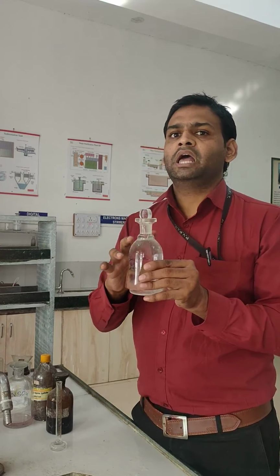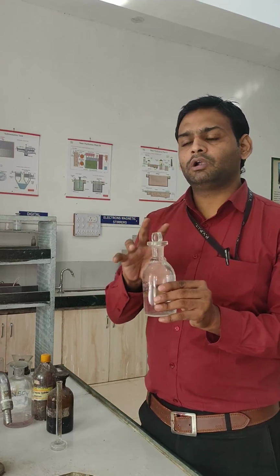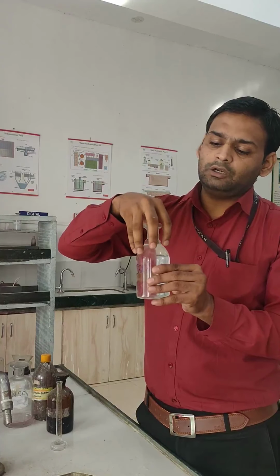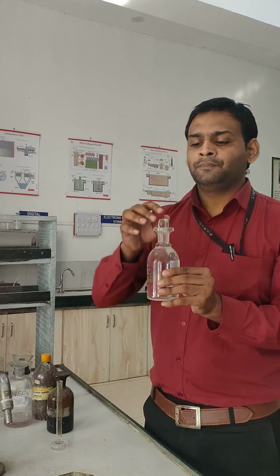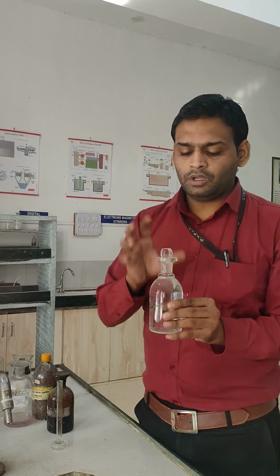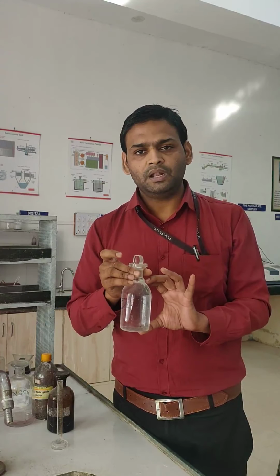If the DO concentration is absent in this particular water sample and we keep the mouth of the bottle open, then what happens? Some atmospheric oxygen tries to diffuse into this wastewater. To avoid such a condition and get an accurate reading, we have to place this cap on top of the bottle. Then we first fill this BOD bottle with 300 ml water sample.